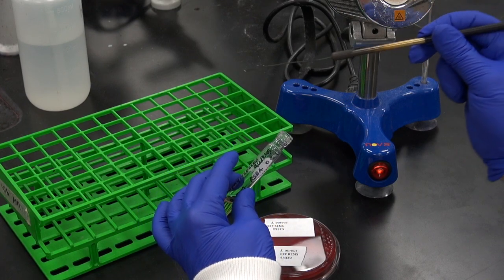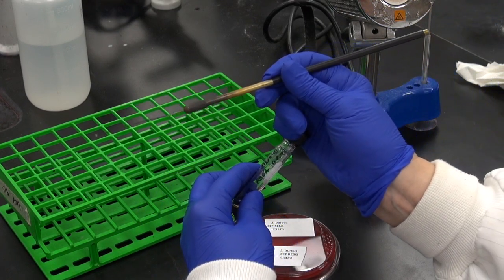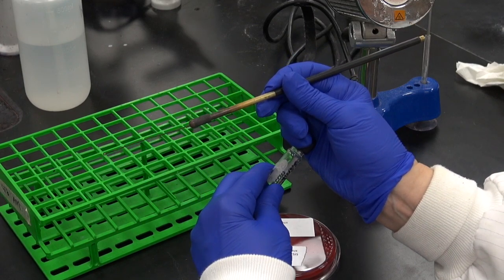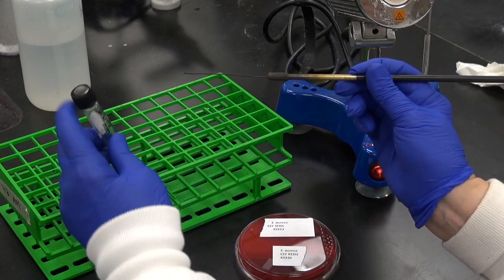Remove the loop from the broth, replace the cap, and place the tube in your rack.